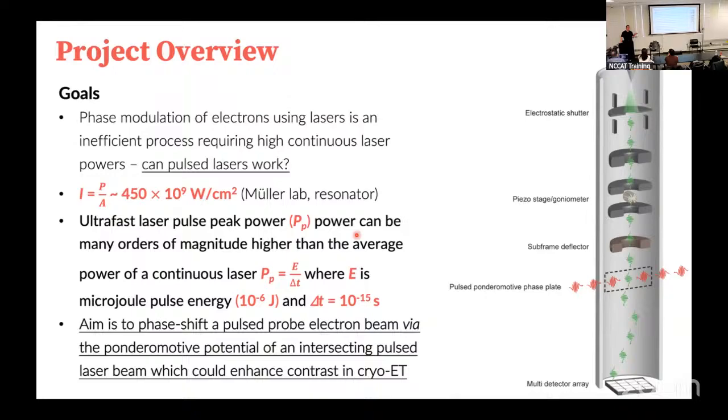Fast forward to 2015, I think, Radostin Danev, who has spent decades working on phase plates, came out with a phase plate called the Volta phase plate that many of us purchased from Thermo Fisher. And it did work. It does work. You do get this phase shift.